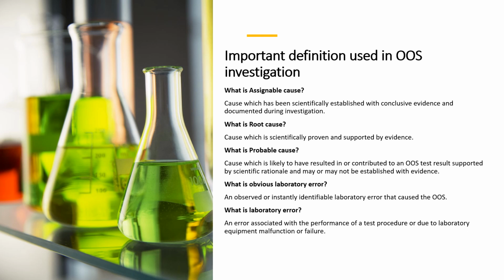Next is, what is laboratory error. An error associated with the performance of a test procedure or due to laboratory equipment malfunction or failure. So in the laboratory, there can be a test procedure error or an equipment malfunction related error. That is called the laboratory error.